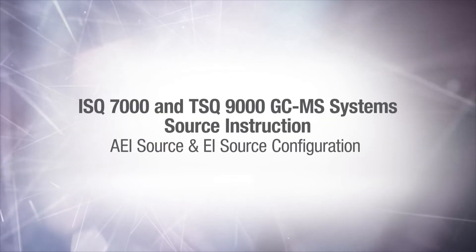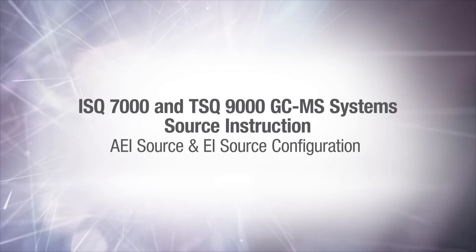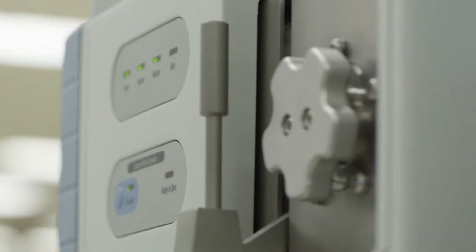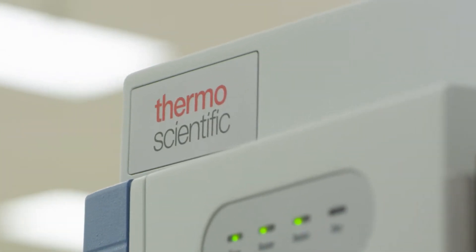Hello and welcome to the source swap instructions for the ISQ-7000 and TSQ-9000. In this video, you'll be instructed on how to change your system back and forth between the EI and AEI source configurations. Please refer to the user guide and hardware manual for more information and help.